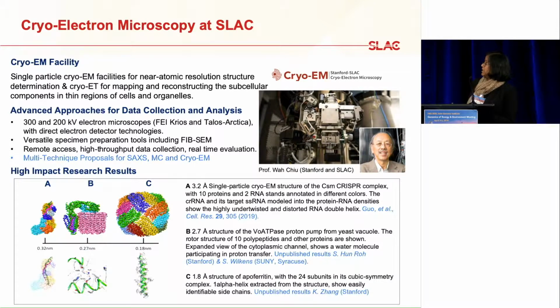You've heard about Cryo-Electron microscopy by Soichi in his talk, and also seen it on our poster, so I won't go into much detail except just have the slide up and say that we have a very exciting opportunity that's coming up in July, where the SMB group is working very closely with the Cryo-EM facilities to come up with a joint proposal to do both macromolecular crystallography and Cryo-EM on the same systems under one proposal mechanism umbrella. So we're excited that that's coming up in July.